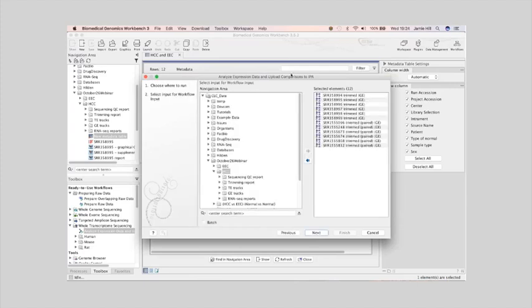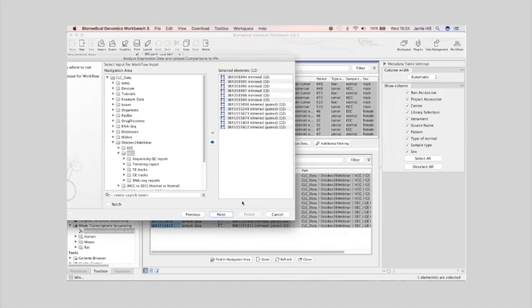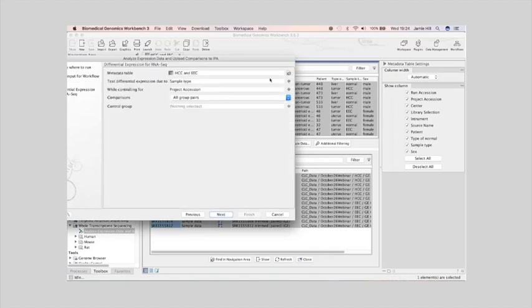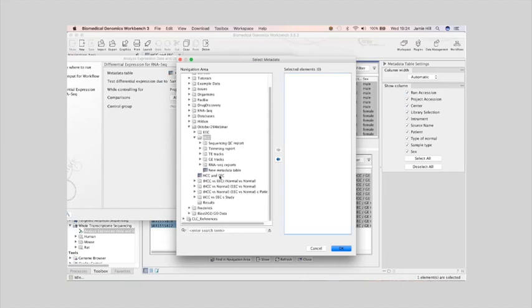So I take in all these 12 inputs, all these 12 sets of gene expressions, 1 for each sample, 6 for the liver cancer, 6 for the uterus cancer. And then we get a little bit more involved. So first of all, I have to tell the statistics what I want to test for, this differential expression. And I want to test the things that are differentially expressed between the 2 cancers.